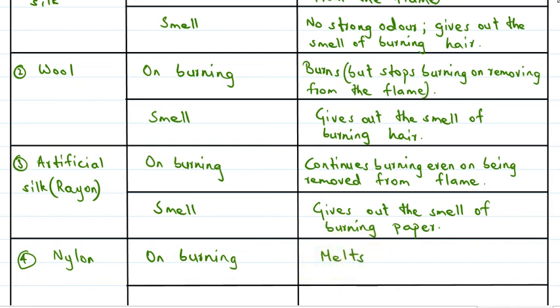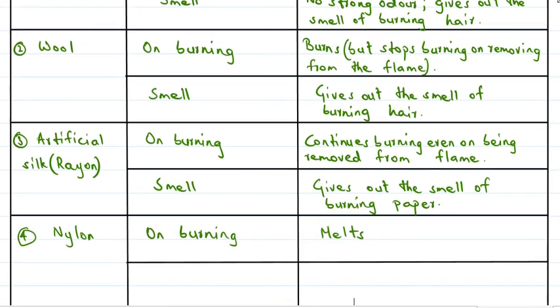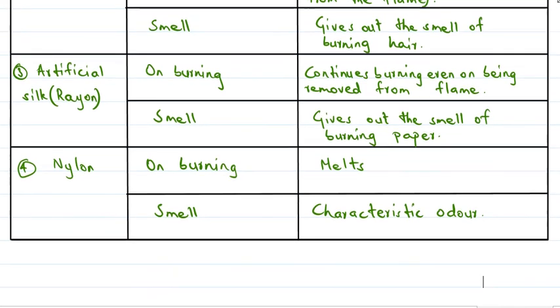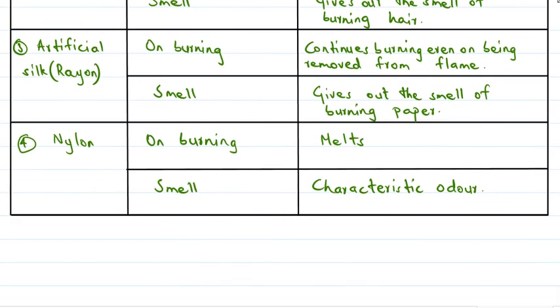Nylon is also an artificial fiber, it is man-made, and it gives out a characteristic odor. So these are the observations we can note down.